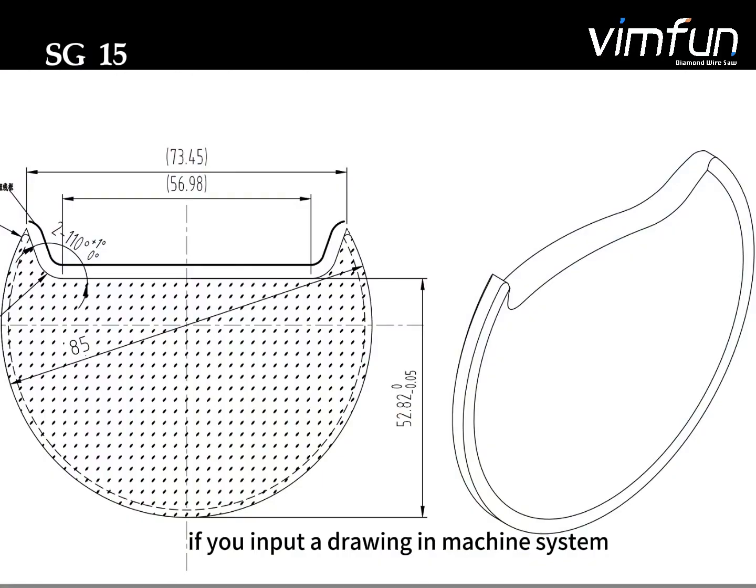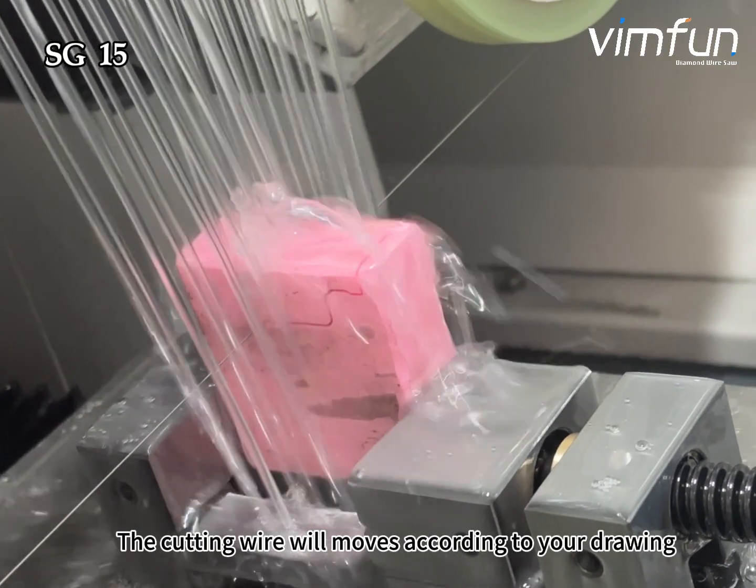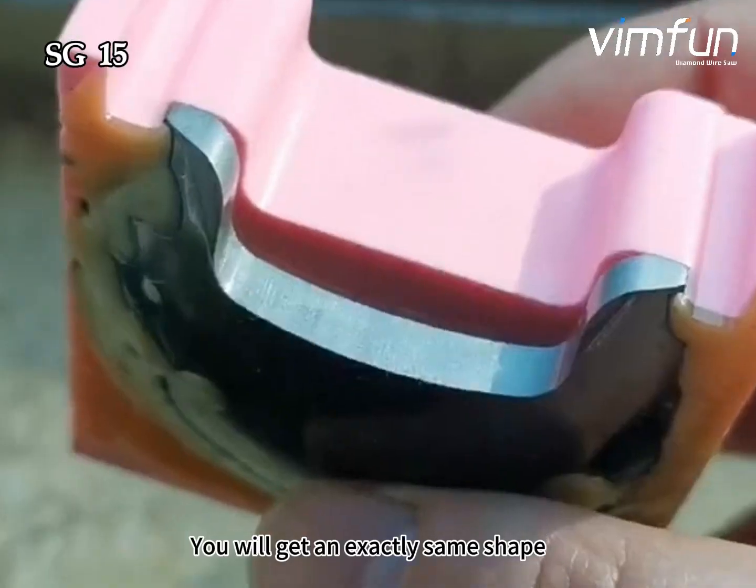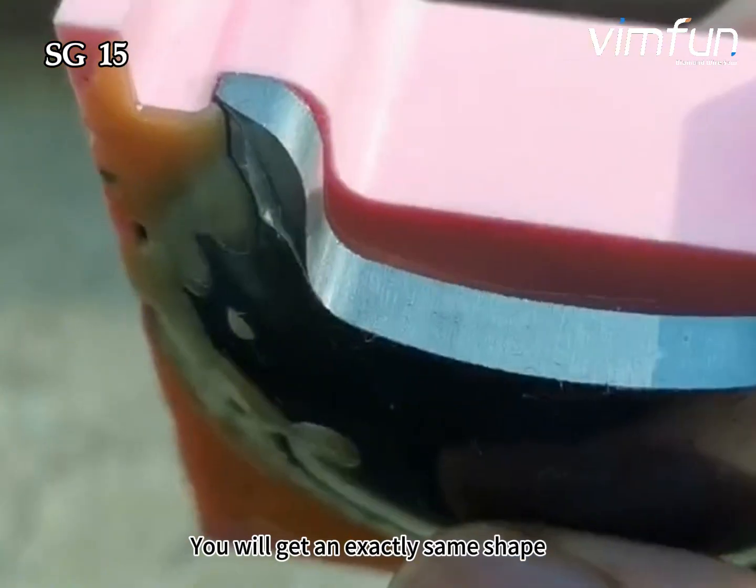If you input a drawing into the machine system, the cutting wire moves accurately to your drawings. You'll get an exactly same shape.